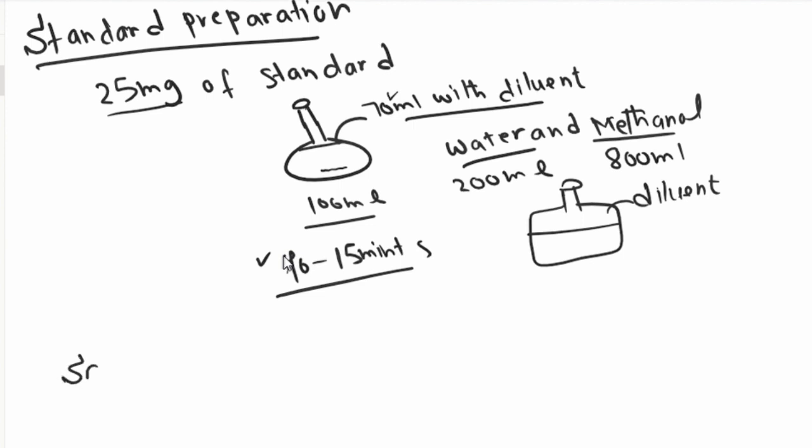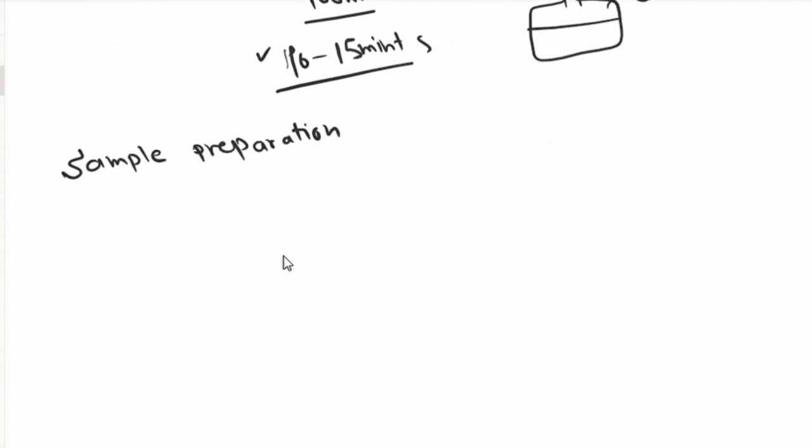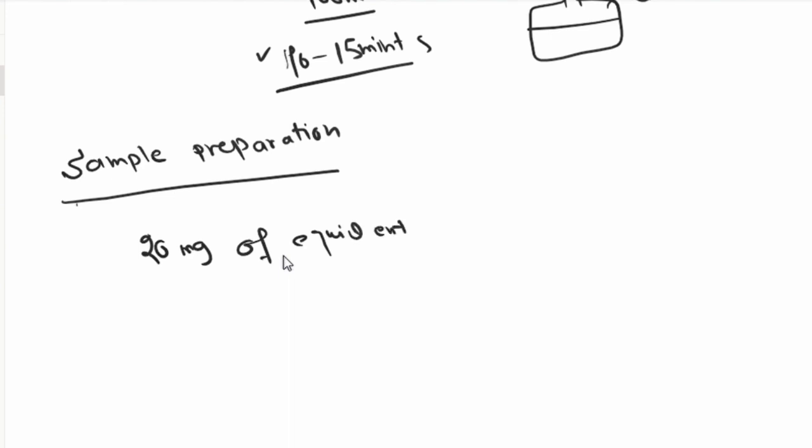Then you need to do sample preparation. For sample preparation, you have to take 20 mg equivalent weight of nortriptyline.